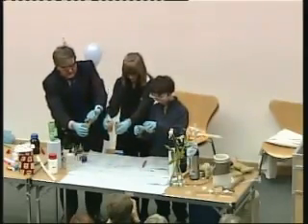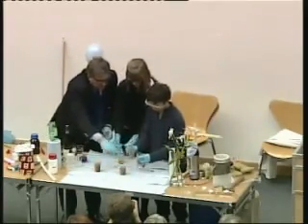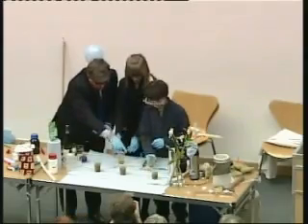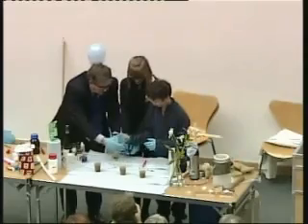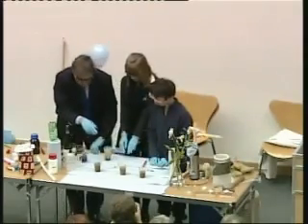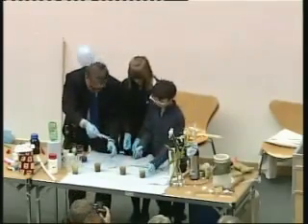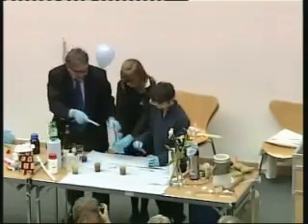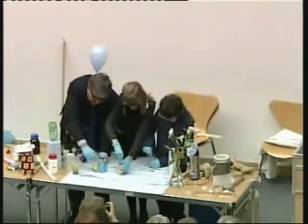That'll do. So put the full one in the middle. Put it separate. And yours over there, just a bit that. Yeah, not quite as far, because you'll see why in a minute. Now give me the empty ones, and I'll get them out of the way. Now we're just going to stir this. All right. So get your stirrer, whatever it is. Did I not give you a stirrer? There you are. Have a stirrer. And then we're just going to stir it as fast as we can. All right. Here we go.